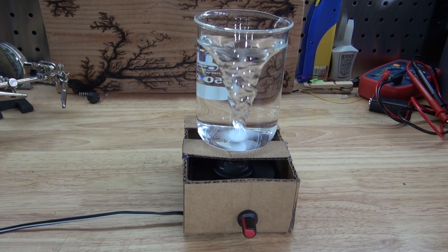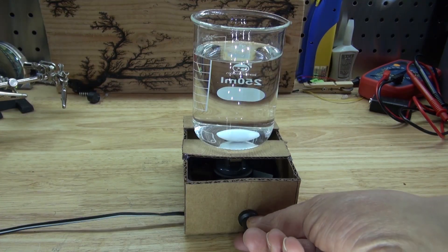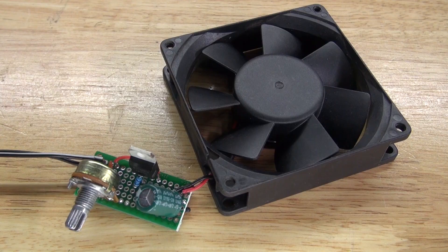Hello and welcome back to SciTiTech. In this video I'm going to show you how to make this very useful stir bar device using a simple voltage regulator circuit. Let's get started.